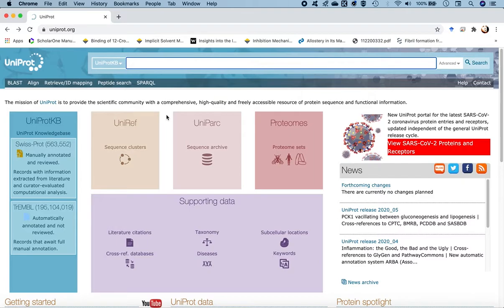But surprisingly enough, the structure for the dopamine D2 receptor is available, whereas the structure for the dopamine D1 receptor is not available. The possible reason being that, since it's a transmembrane protein receptor, it has a membrane component in it. And when you do the X-ray crystallography, which has to be done specifically in a lipid kind of environment, it might sometimes be difficult to resolve the structure of the protein in a lipid environment.